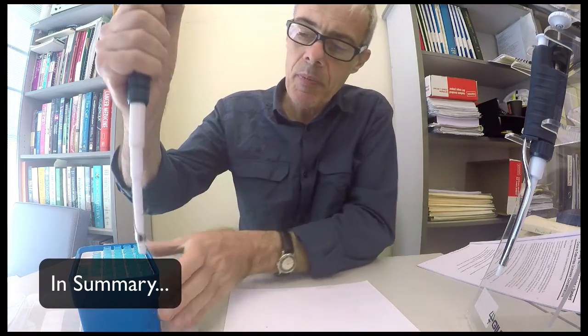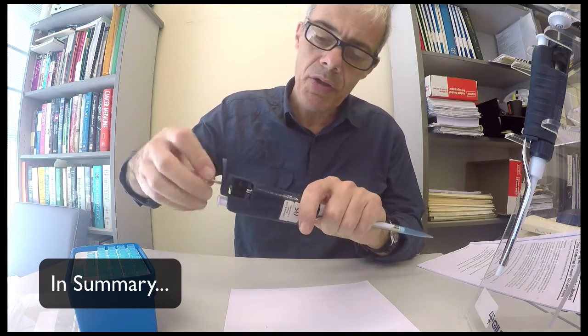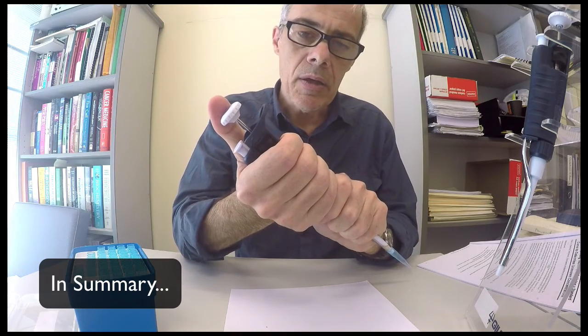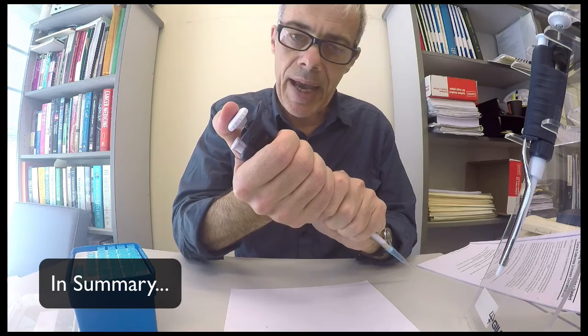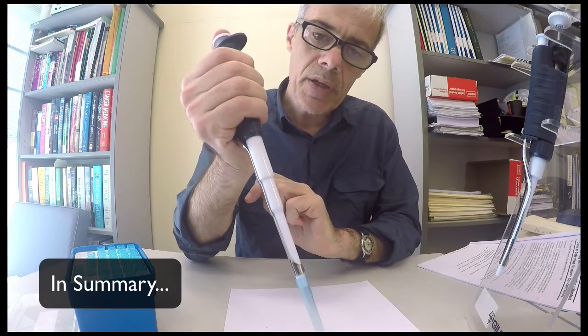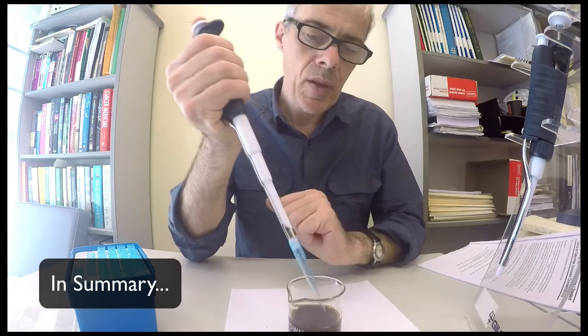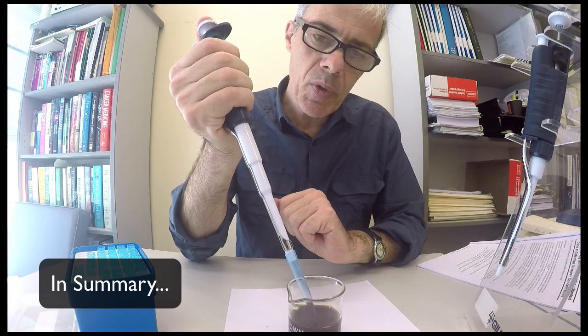When you're using any of these pipettes, you place a tip on, you set your dial to the volume, you then move the plunger down to the calibrated stop, you immerse into your solution.